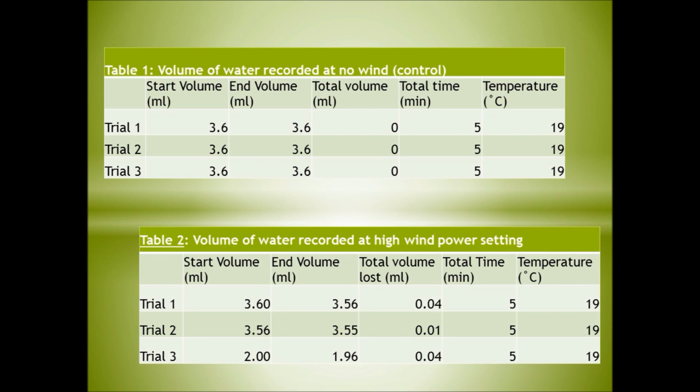Results. As seen in Table 1, a control was performed in which a fan was not used to blow wind onto the leaves of the plant. After 5 minutes, the volume of water in the pipette did not change. This is visible in all 3 trials.